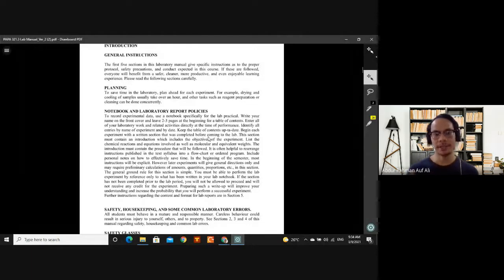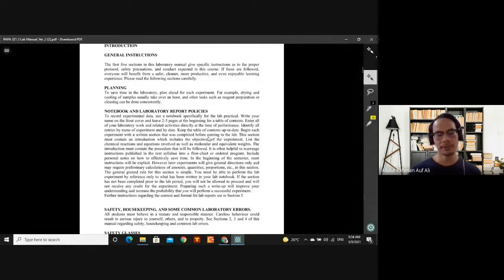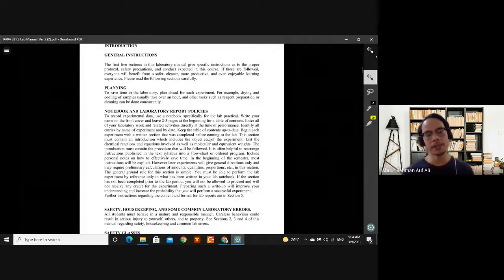Because in the lab, that is what we are exposed to. We will use chemicals, there are fumes from these chemicals, and also dust from the results of mixing all these chemicals. So that's why we use N95 carbon-based, because the carbon will help filter out all the fumes and the smaller dust particles from getting into our lungs and our body.